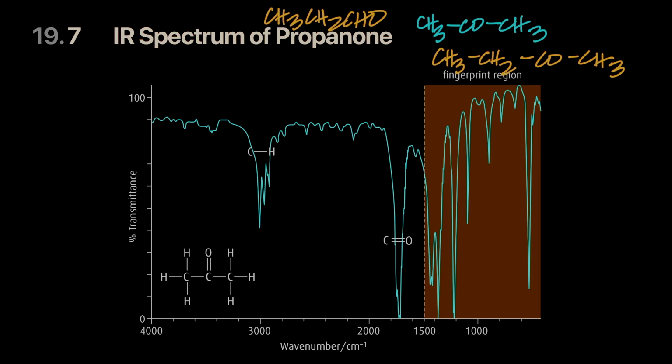So there's nothing much to do there except use a computer to match this molecule's fingerprint region to an unknown, because let's say you did not know this was propanone. This was an unknown graph. But you already have the propanone graph. And you will realize that propanone's graph and this molecule's graph on this region matched. Ditto. But it is not necessarily the case with this region. This region will match for propanone, butanone, hexanone, pentanone, methylpentanone, butanone, whatever. No methylbutanone, but you get what I'm saying. Ketones and aldehydes will have similar such regions.